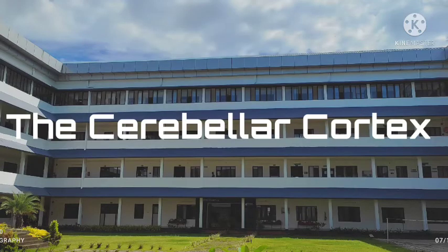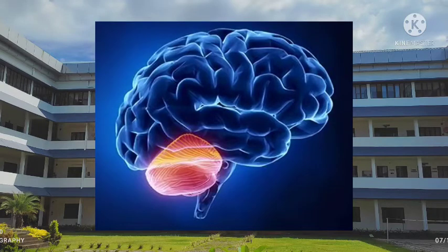Next, the cerebellar cortex. The cerebellum, or the small brain, lies in the posterior cranial fossa. Like the cerebrum, the cerebellum has a superficial layer of gray matter, the cerebellar cortex. Because of the presence of numerous fissures, the cerebellar cortex is extensive.